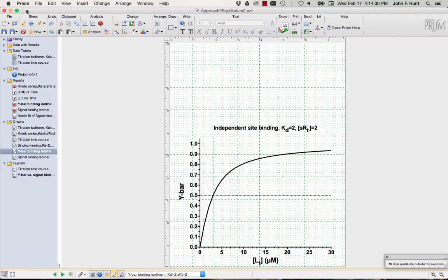And then once we've done all that, we will take a step back and look at the scientific and conceptual content here. What you will see is that the parameters you get from the curve fitting analysis once you add noise to the data are the most probable estimates of the parameters given some error model. You'll see that once you introduce a significant amount of noise into the experiment, the most probable estimates of the underlying parameters describing the experiment start to move away from the actual values.